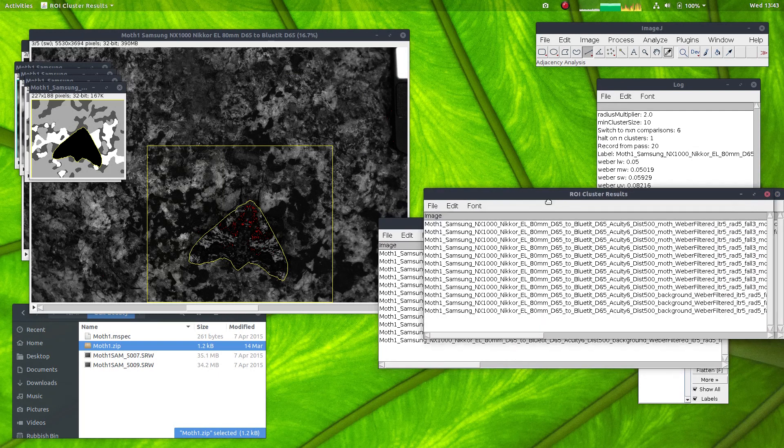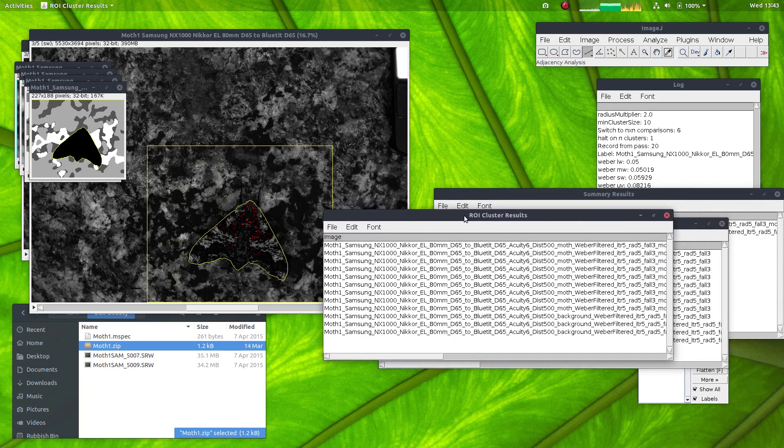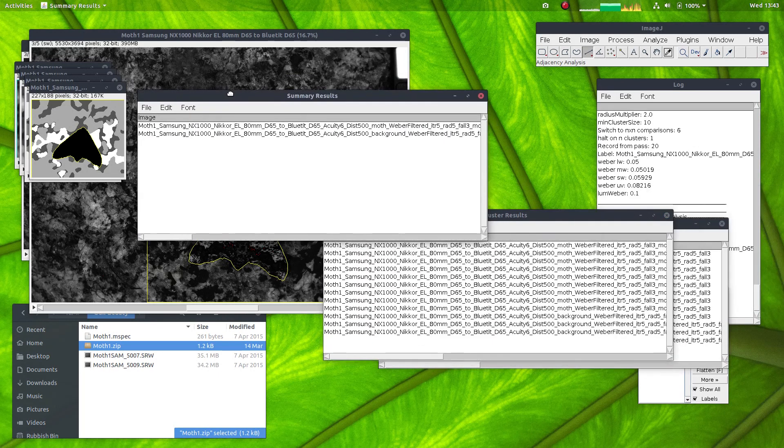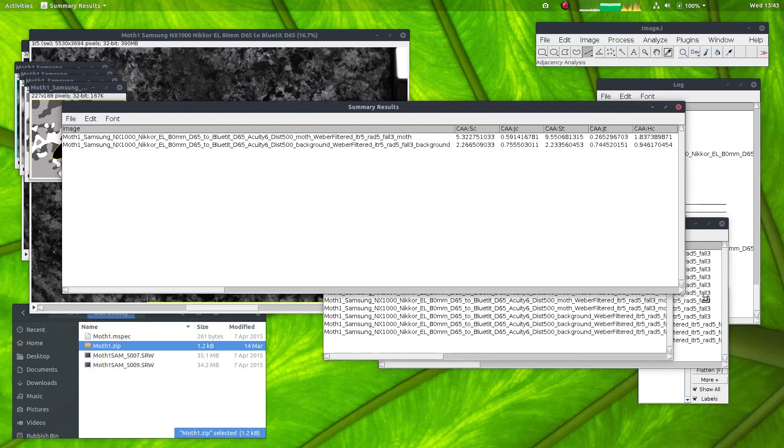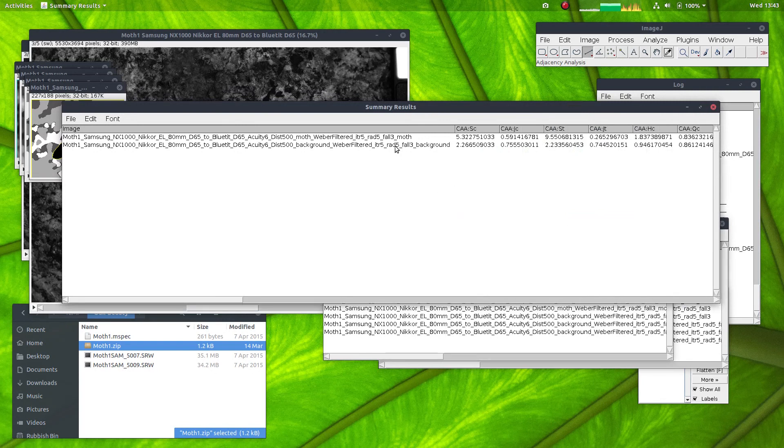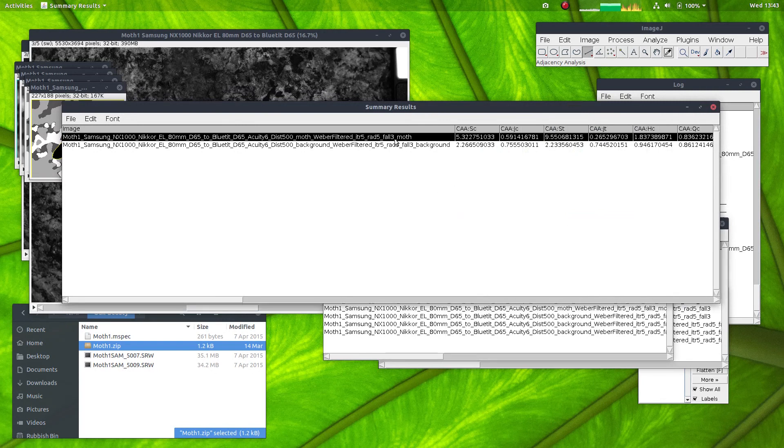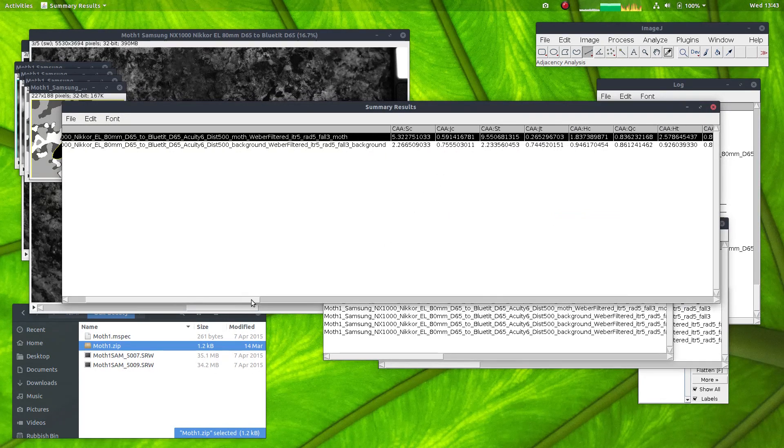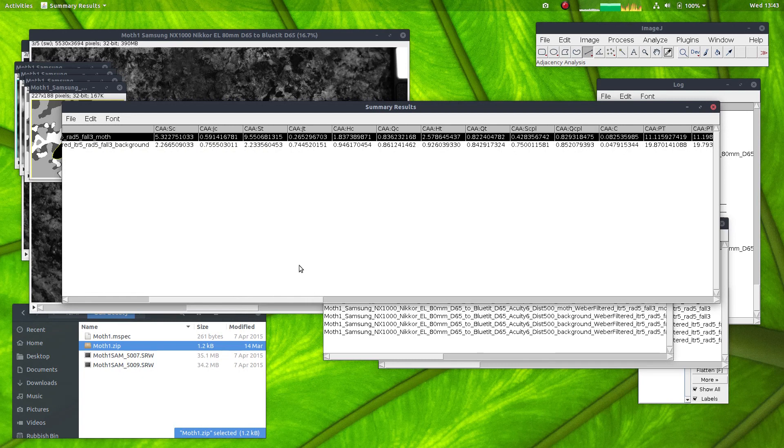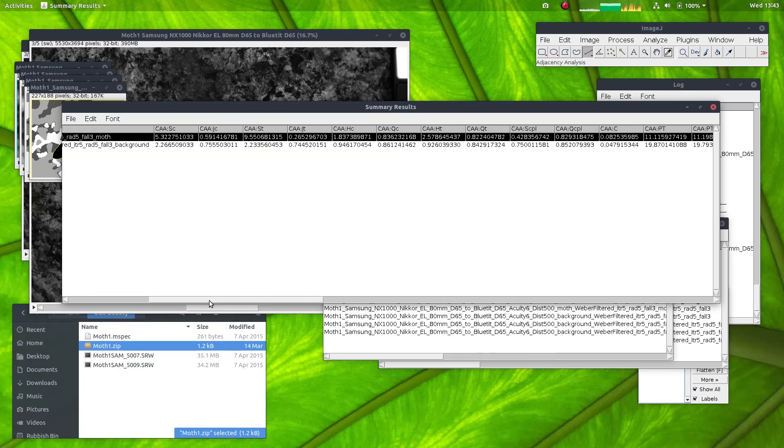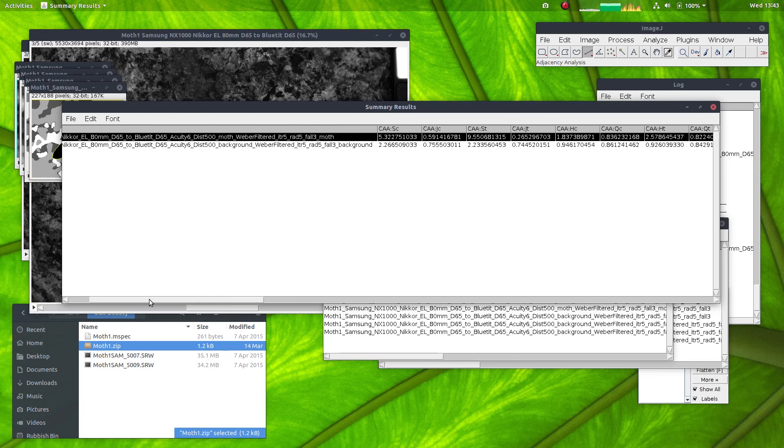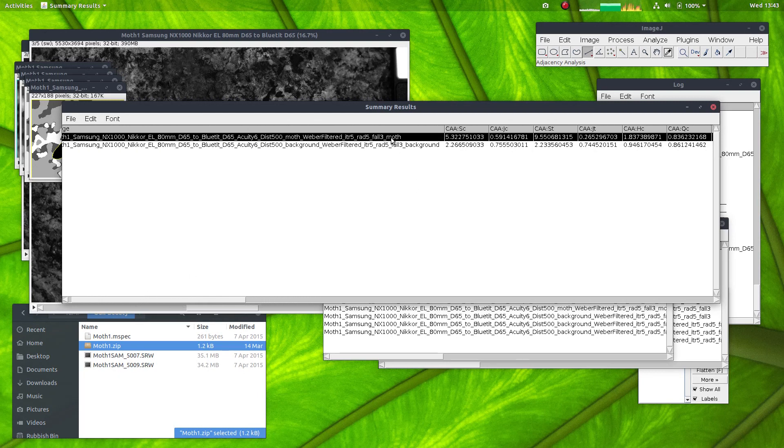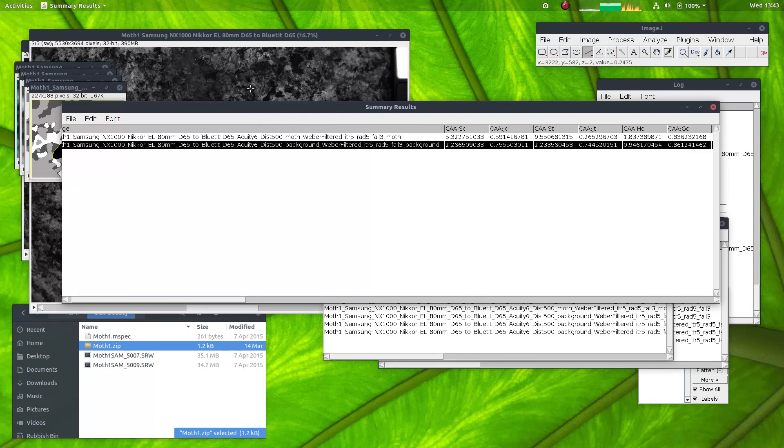And here we go, it's finished. So if we look at the summary results now, we have the QCPA analysis, so the adjacency analysis, the boundary strength analysis, and visual contrast analysis performed completely independently for the moth and its background.